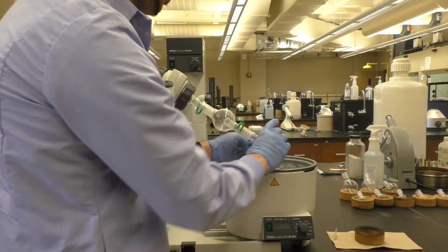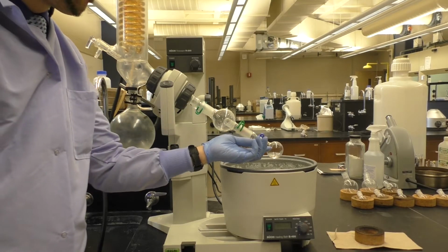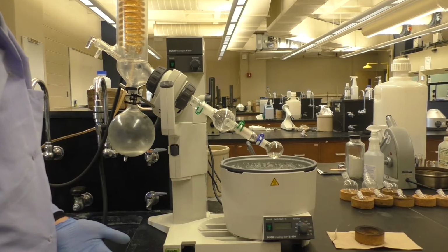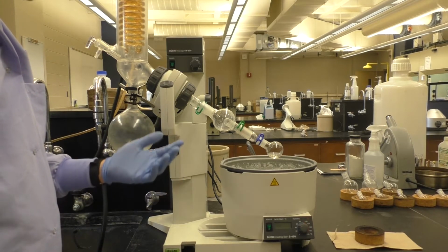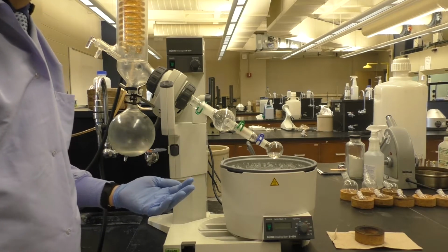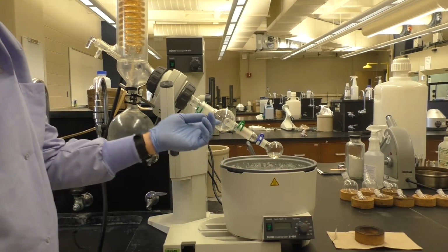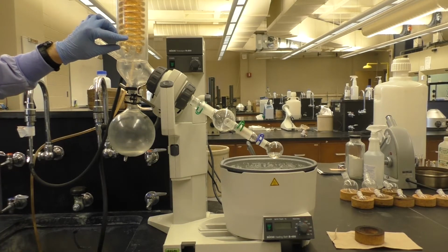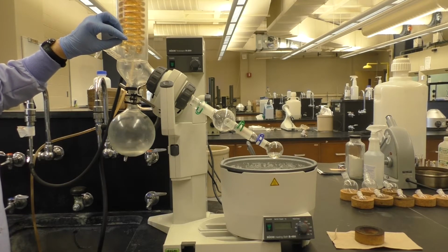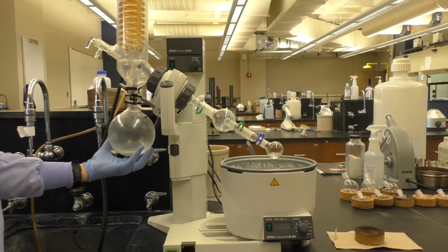So that snaps in place. Now when I turn the water aspirator on, it will pull a vacuum on the system, all the way down into the headspace here. Because the boiling point of a liquid is when its vapor pressure is equal to the atmospheric pressure, if I pull a vacuum and reduce the atmospheric pressure, I will get that liquid to boil at a lower temperature. The vapors can then travel up through this column, hit the cold water coils here, the chiller coils, condense back into a liquid, and then drip down and be collected in this solvent trap shown here.